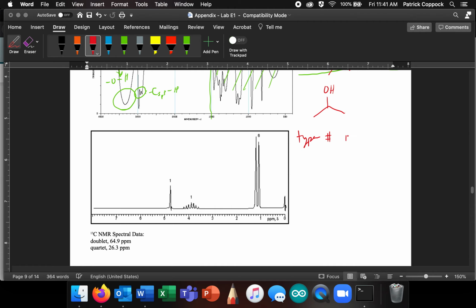number, try to write a little slower so my pen doesn't mess up, number of neighbors, n+1, and shift. Okay, I don't have my book open, but remember it's about page 666. It's the page of the beast, right? So here I'll call that A, I'll call this B, and I'll call that C. Marker's going a little slow.